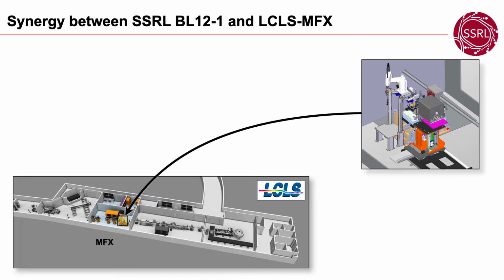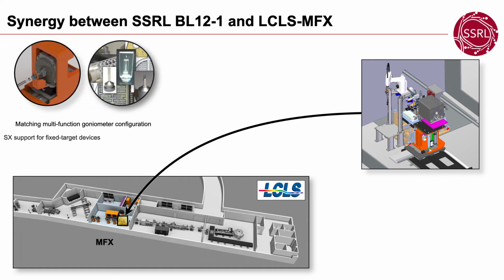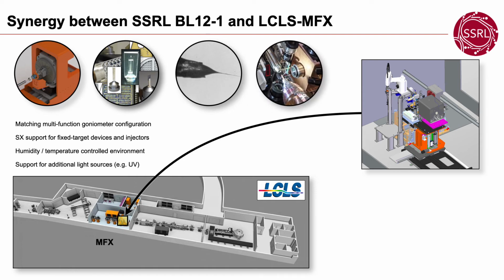This setup has been replicated at the LCLS MFX end station. The matching multifunction goniometer configuration, support for fixed target and injector devices, humidity and temperature control environment, and support for additional light sources such as UV makes these sister stations. You can perform the same exact experiment at BL 12.1 and at MFX, with the only difference being whether the radiation is synchrotron or XFEL.